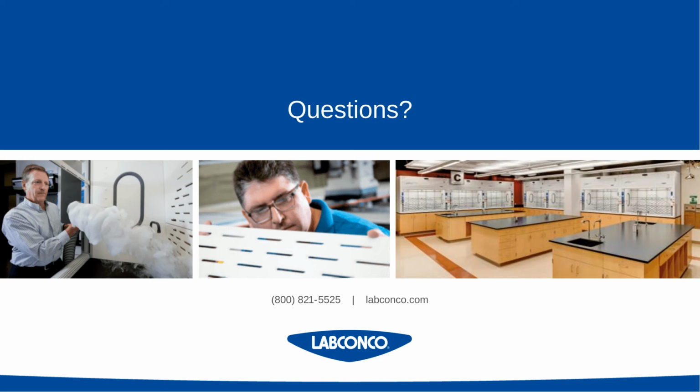With auxiliary air hoods, they're often in a building that was designed with an exhaust system, and the supply air was sized to only supply a certain amount of air to the lab space. If a new type of hood is being put in there, it needs to be able to operate within the energy capacity of the lab space. So ultimately, if the auxiliary air hood was operating with 30% of conditioned air that was supplied to the lab, the new hood should be able to operate within the supply and exhaust capacity of the existing mechanical system associated with it.